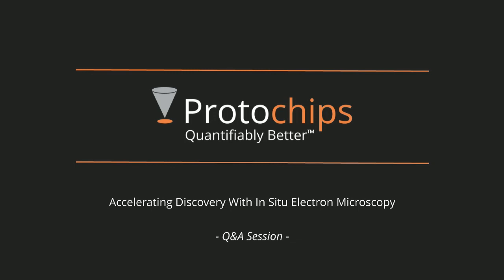Okay, we got a follow-up question to Ray's answer about time resolution. Have you tried imaging the atom diffusion along 2D material edges using transmission electron microscopy rather than STEM?